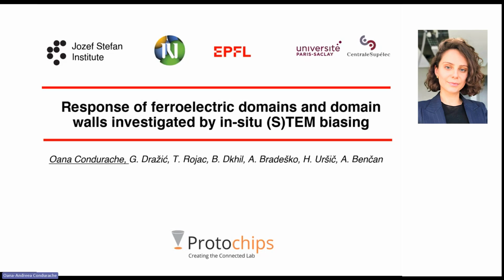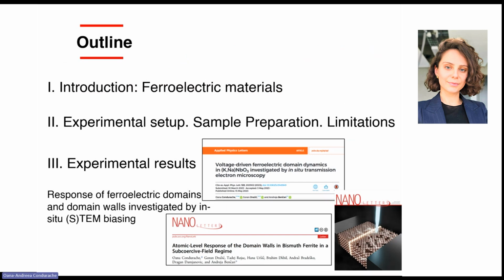This was a collaborative work between different people and different institutions, as you can see on the slide. And I will briefly introduce to you ferroelectrics. I will talk about experimental setup, sample preparation, and which are, in my opinion, the major limitations associated with in-situ biasing on ferroelectrics. And further, I will show you some experimental results which have been published in Applied Physics Letters and Nanoletters.